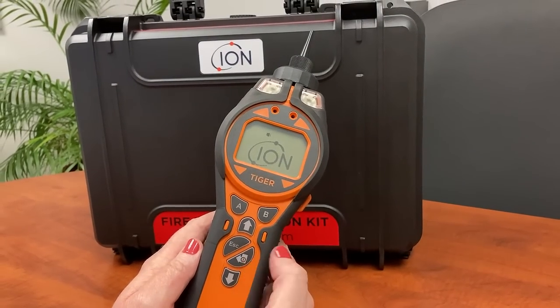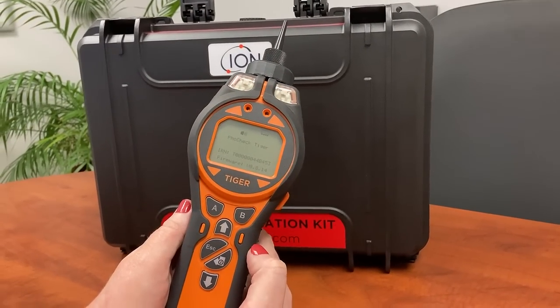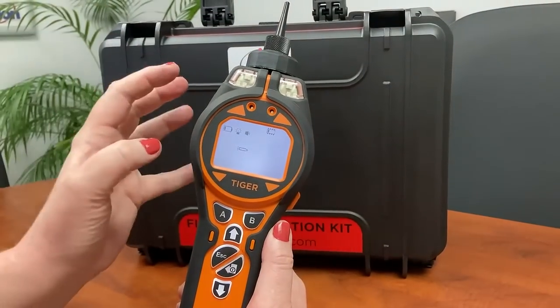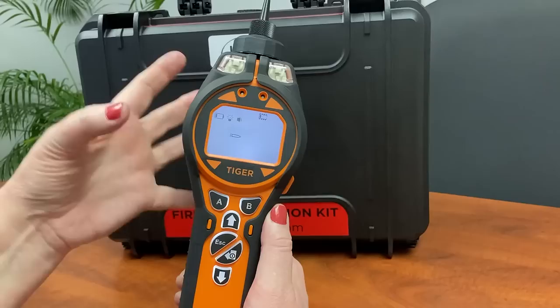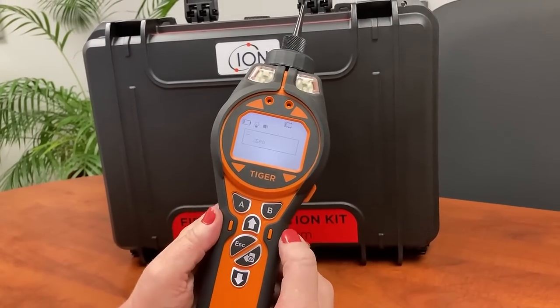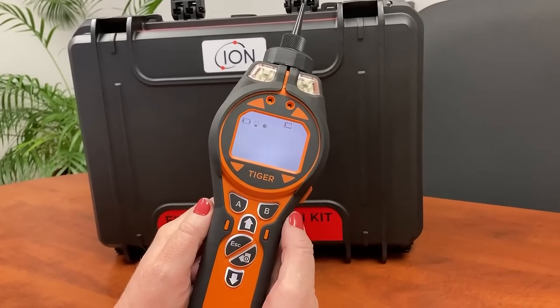We power it on. When it switches on it does a time check and it does zeroing while it's busy. The instrument has an audible alarm, visual lights, and it also vibrates if you've switched that on. When it's completed the setup and check, it will go to the home screen.